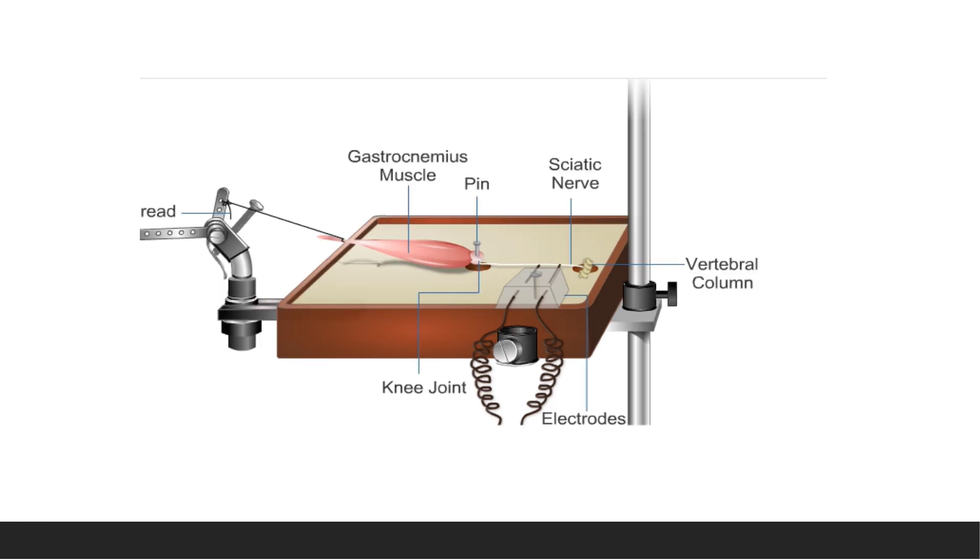Tie the tendon — which already has a thread attached — to the short arm of the muscle lever. The preparation is now mounted over the myograph board. The gastrocnemius muscle is fixed at the knee joint with the help of a pin, the sciatic nerve is in place, and the electrode touches the sciatic nerve. By giving electrical stimulation to the sciatic nerve, we can study the properties of the gastrocnemius muscle, which is a skeletal muscle. This completes your nerve-muscle preparation.